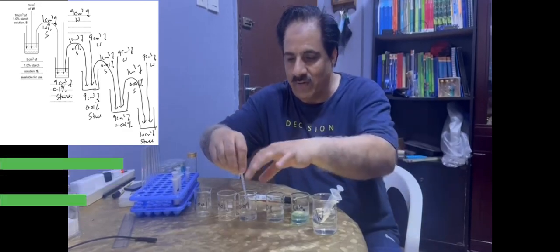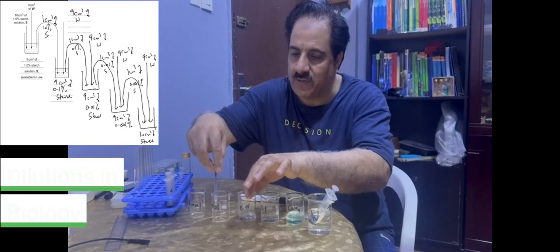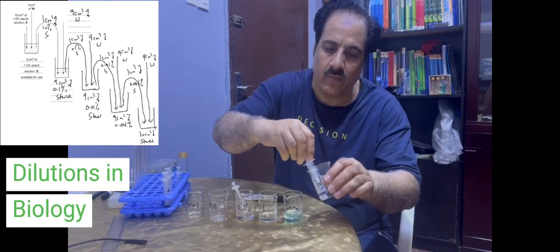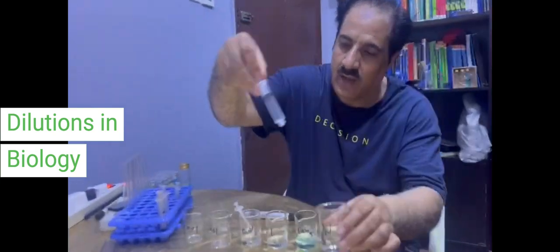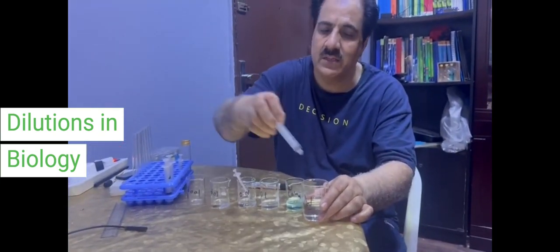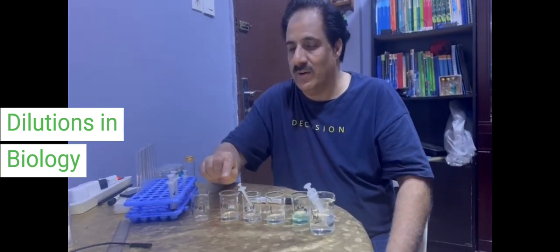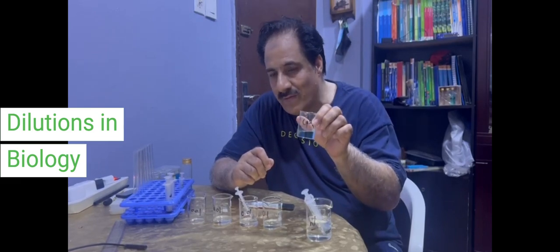So again, we'll take 1 centimeter cube from here after washing, put it in the next beaker, and add 9 centimeter cube of water from here. So we are reducing the concentration. This is the 9 centimeter of water, and we have made the 10 centimeter cube of 0.01% solution. So same will be, we will take 1 centimeter from this one, and we will add 9 centimeter cube of water. So in the serial dilution, we are using the stock solution only once, that is in the first dilution. Then the next dilutions are successively done in these beakers.